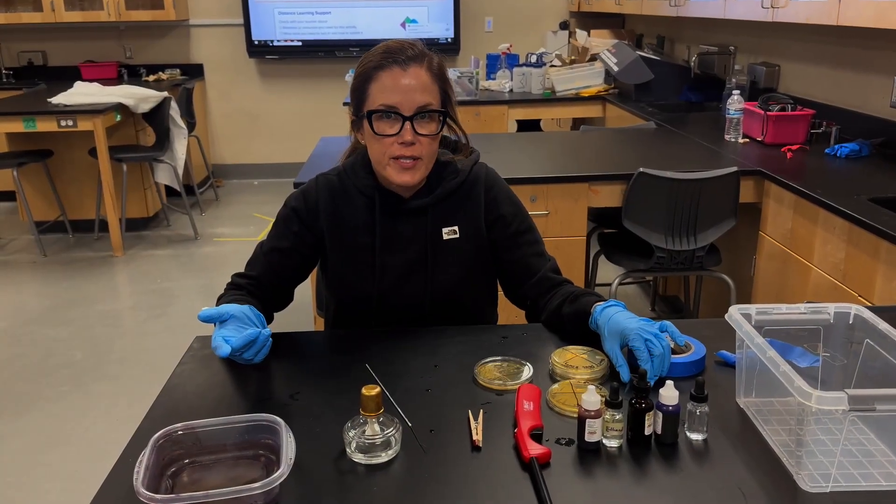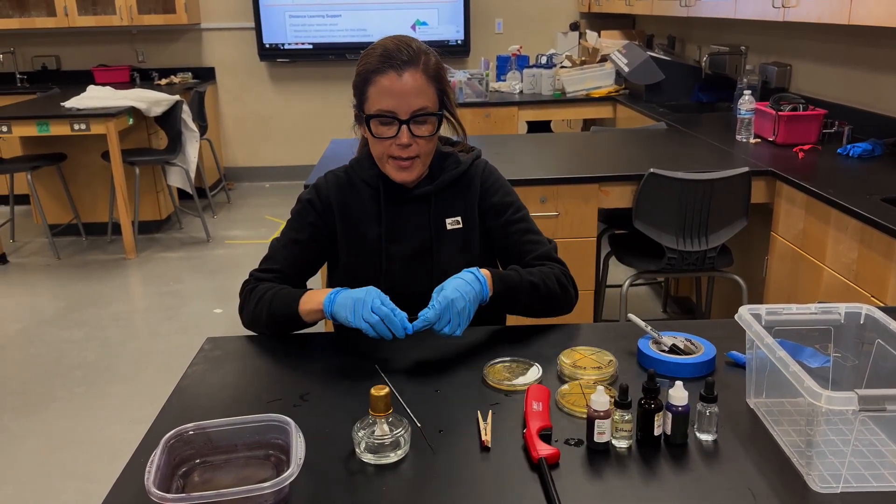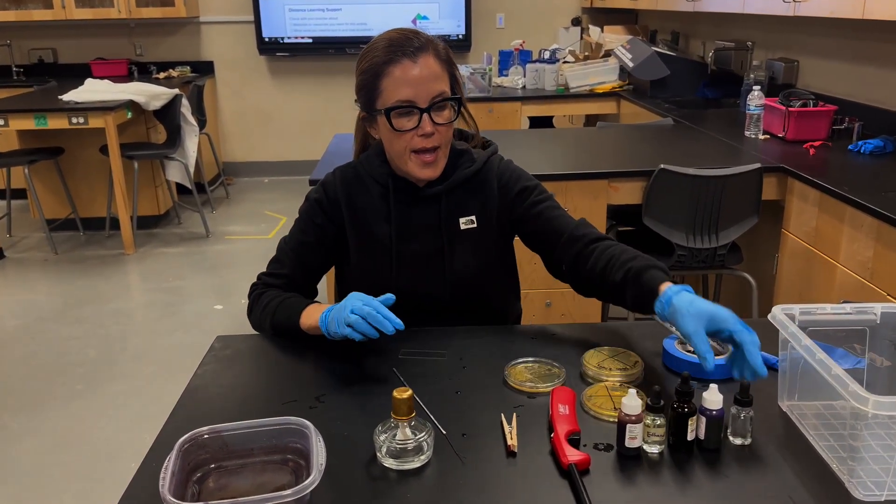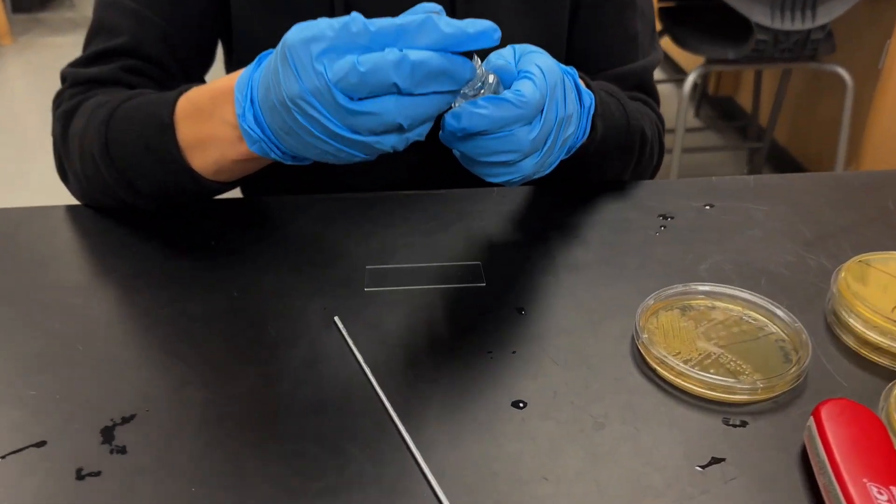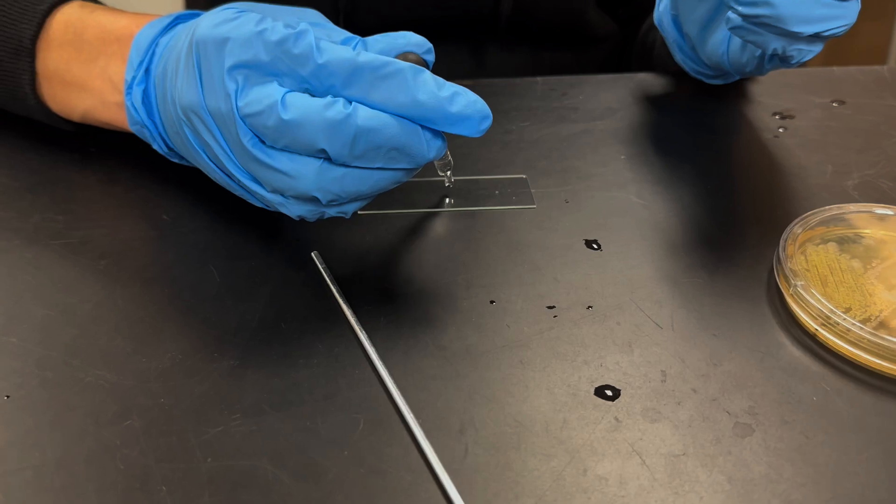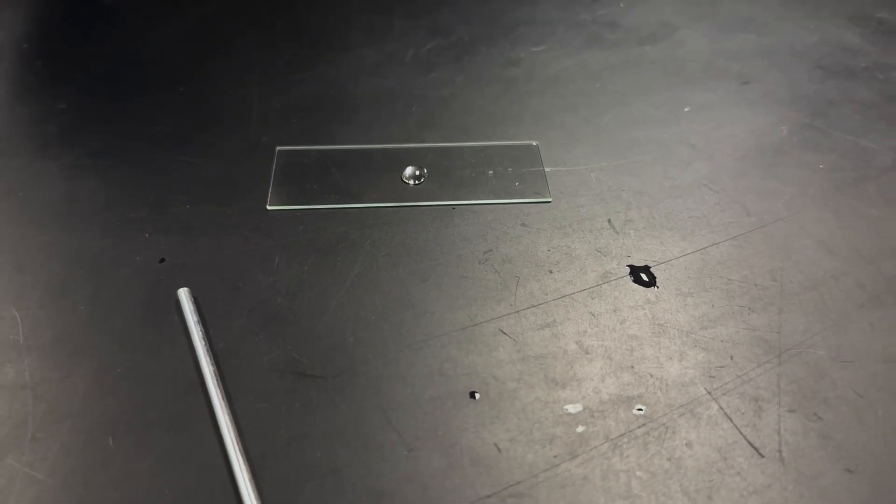When you're ready to begin with your first sample, you're going to take the microscope slide. Just place it in front of you. And you're going to put one small drop of water in the center of the slide. It's important that it's a small drop of water because we want it to air dry before we can move on to the next step of the experiment.